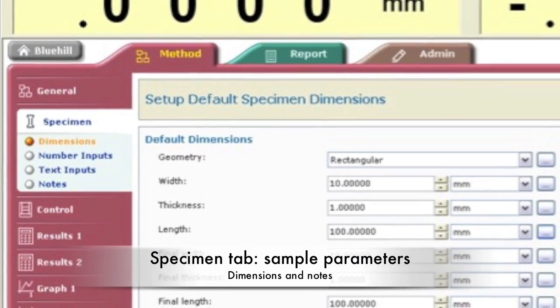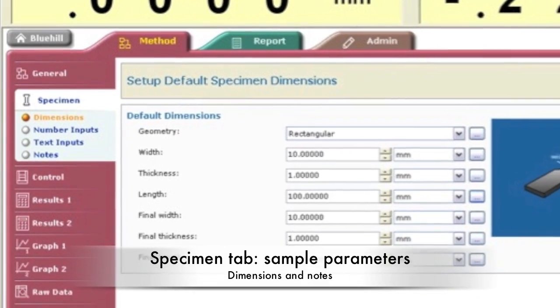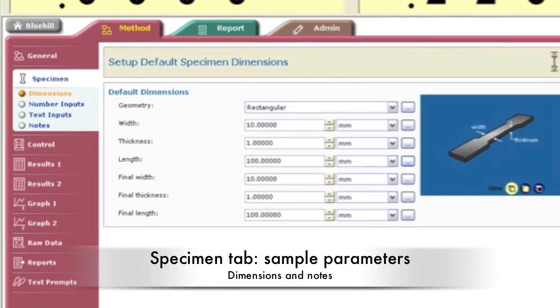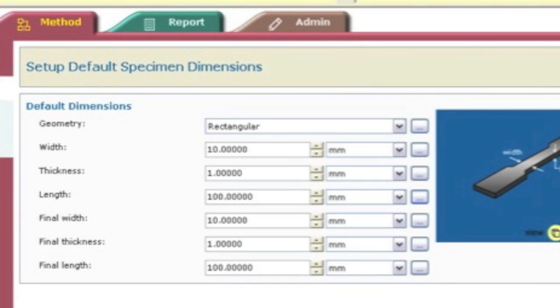The specimen tab is for specifying sample dimensions and parameters. A dog bone sample is used for this test. Select rectangular and specify the width, thickness, and gauge length of the sample. The gauge length is the distance between the clamps before starting the test.